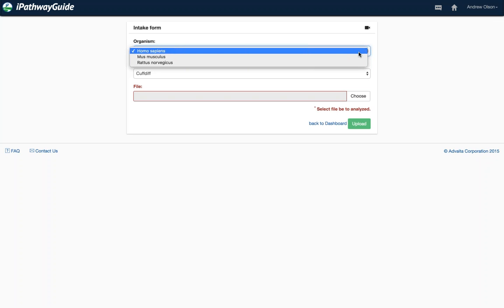Great. I'm actually going to combine two of the questions because they are similar. One of the questions was, can this tool be used for RNA-seq analysis? And another question was about someone who wanted to identify biomarkers based on variant data, and she wanted to know if she could upload variant data. Gotcha. So iPathwayGuide is currently designed for gene or protein expression, or transcriptomic expression. So that would be your RNA-seq, your microarrays, as well as your mass spec discovery proteomics type of data.